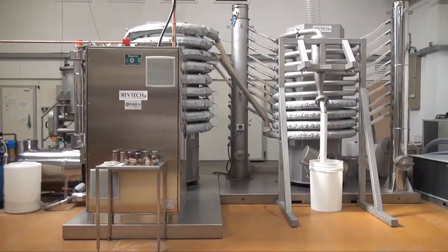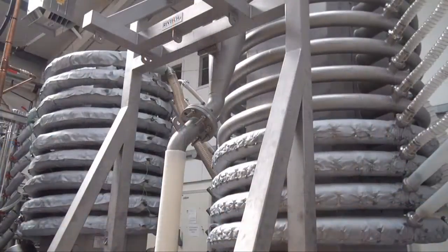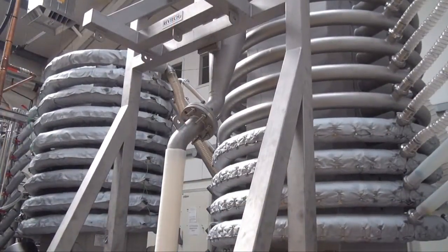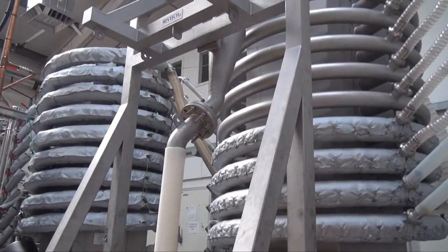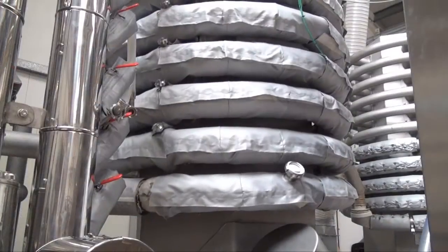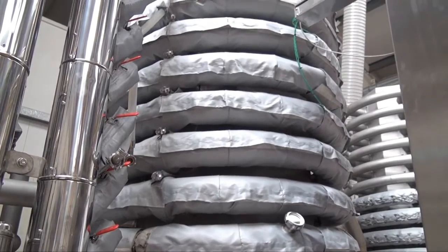The system, developed by RevTech France, uses two spiral columns — the first for pasteurizing and the second for drying. The dry particles are moved up the pasteurization spiral by vibrations that also help prevent the particles settling and scorching. The residence time and the spiral temperature can be varied to deliver an appropriate heat treatment.